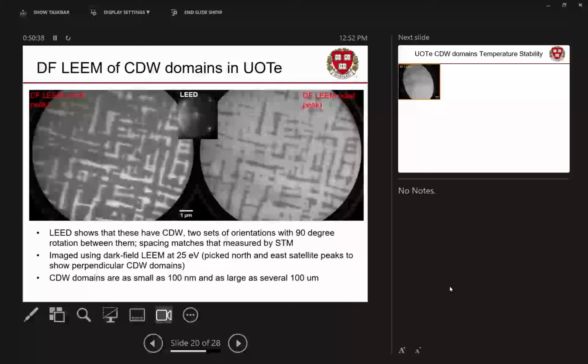And you see in the diffraction pattern, you've got these nice cross signals. The spots for the charge density waves are actually quite close to the primary spots. That's because they are at long periodicities relative to atoms. Diffraction patterns live in inverse space, where things that are far apart in the real world are close together in diffraction patterns. It's weird. So that's pretty neat. We can actually directly image these.